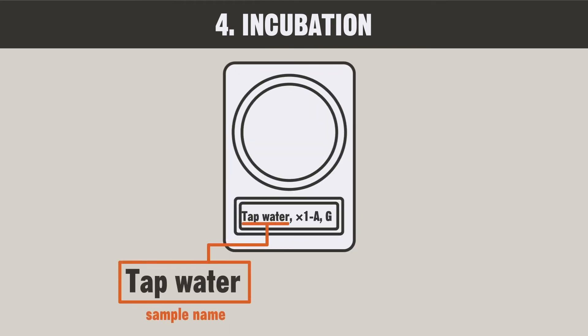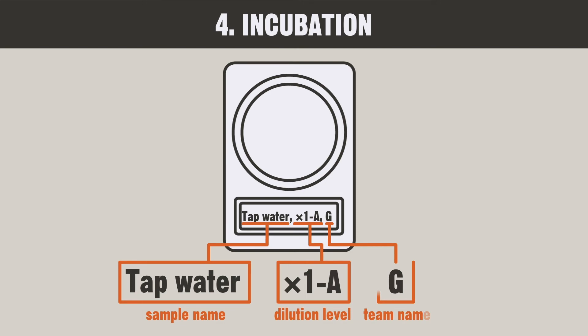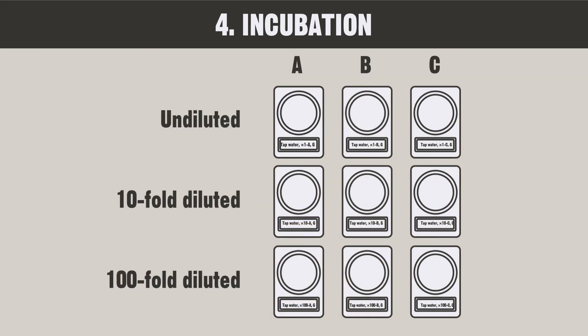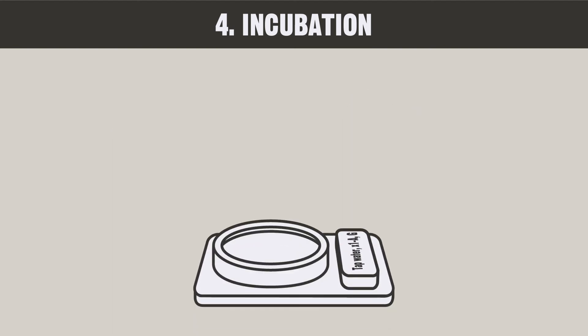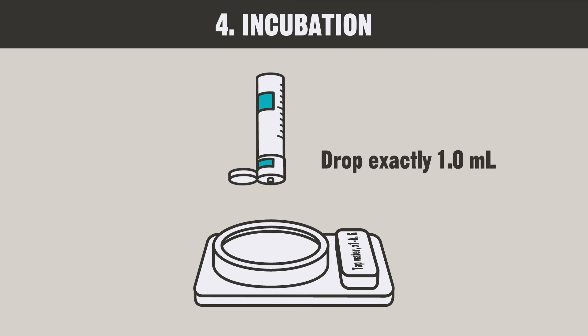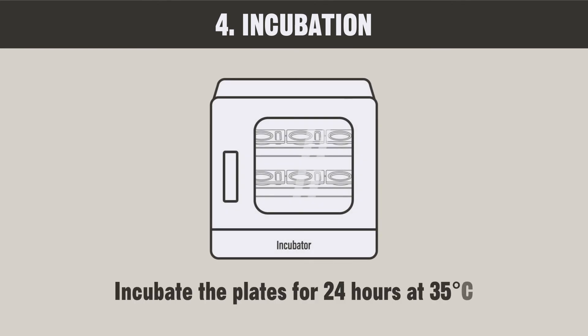Label each plate with the sample name, dilution factor, and team name. You will be labeling 9 plates in all. First, shake the sample water well. Remove the lid of the plate, turn the bottle upside down, and using the marks on the bottle, drop exactly 1 milliliter of the sample on the plate. Confirm that the dropped sample has spread on the plate, and then close the lid. Repeat this process 2 more times in each dilution. The plate with the sample water should be warmed for 24 hours at 35 degrees Celsius in an incubator to let the E. coli grow.